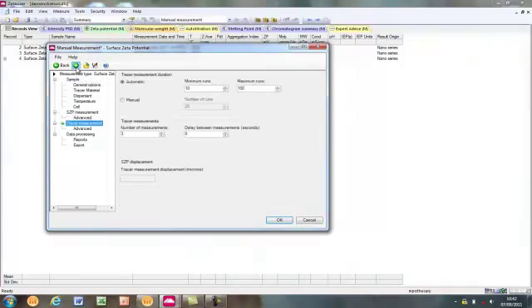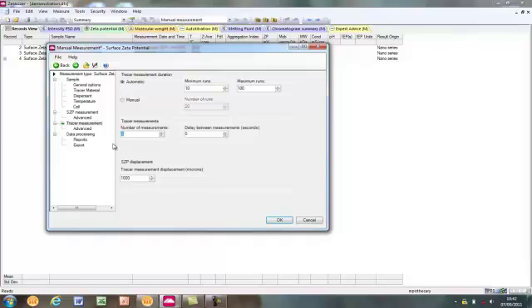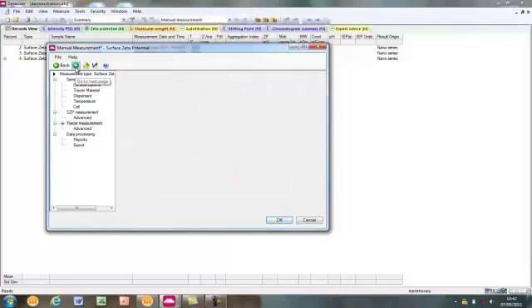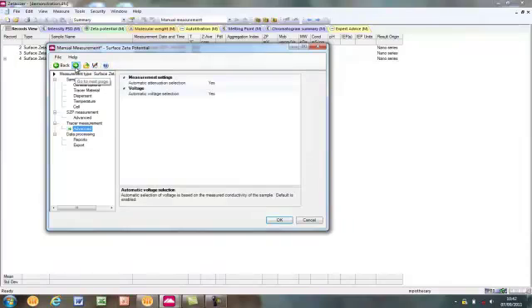The tracer measurement settings relate to the electrophoretic only measurements performed at the end of the experiment. Since this is a fast field measurement, the maximum number of subruns can be left at 100. Again, it is recommended to run at least five tracer measurements, although these being fast field measurements, it is okay to leave a gap of just 20 seconds between the individual measurements for re-equilibration. The tracer measurement displacement sets the distance that this final fast field only measurement is made. The advanced settings can again be left to automatic.